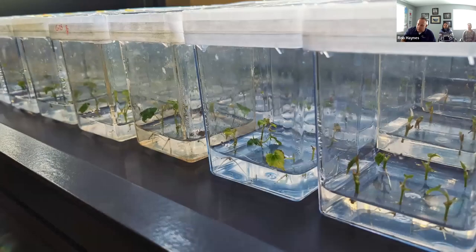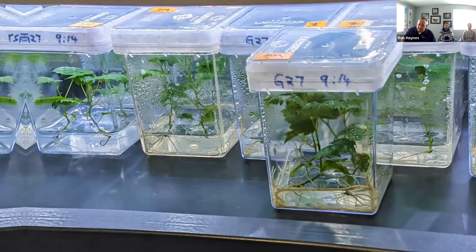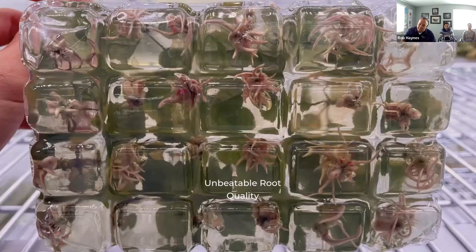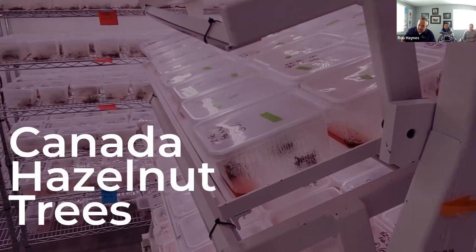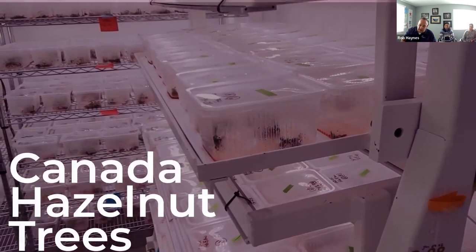So the apples have actually been extremely successful micrografting. We've been able to graft apples that you can't even see where the graft is. So it's becoming difficult trying to explain to some farmers that we actually grafted it. But we're now transferring that same technology into grapevines and being able to micrograft the grapevines in the same way.